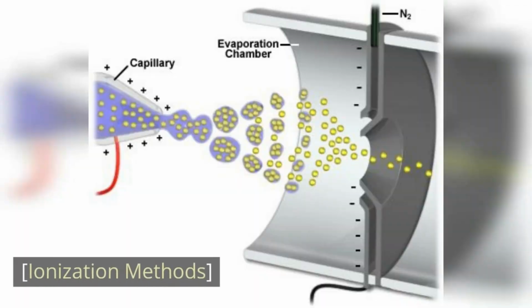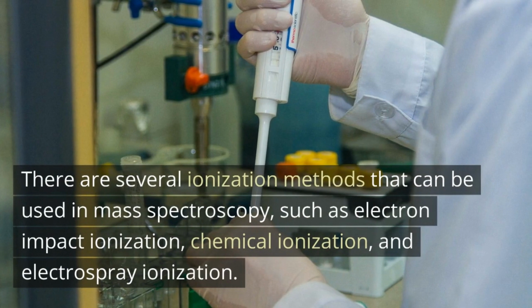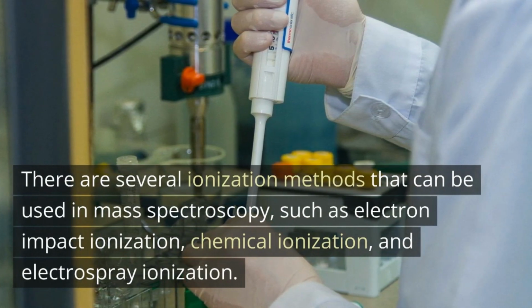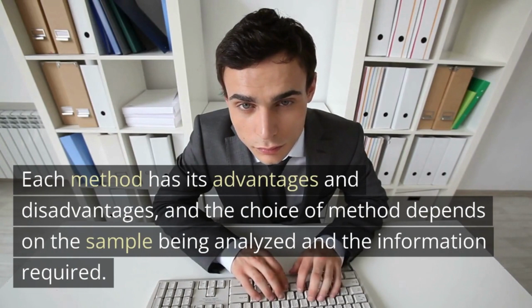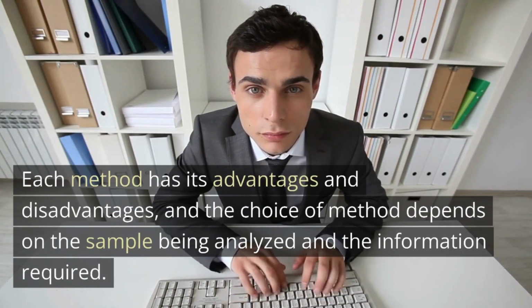Ionization methods. There are several ionization methods that can be used in mass spectroscopy, such as electron impact ionization, chemical ionization, and electrospray ionization. Each method has its advantages and disadvantages, and the choice of method depends on the sample being analyzed and the information required.